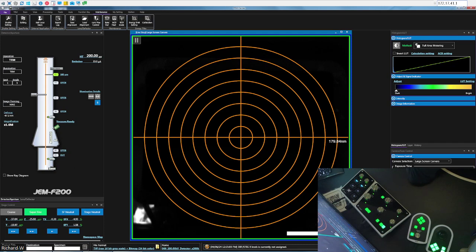So typically when we start the microscope session, we'll be using spot size 1 and angle 5, and that's something we're going to change in a bit. So all that information is displayed on the computer screen. We have the magnification here, and we have the defocus value here. So I hope you can read those. If not, I'll say what they are.